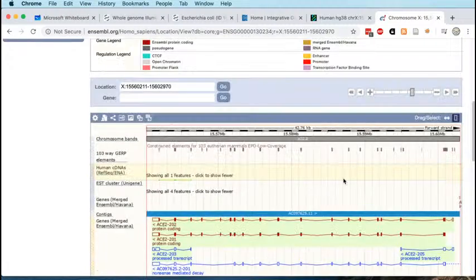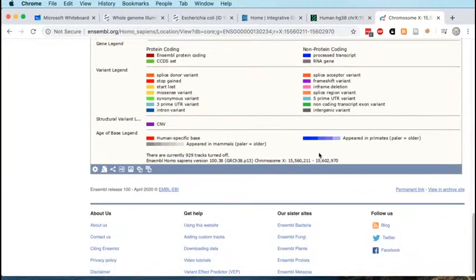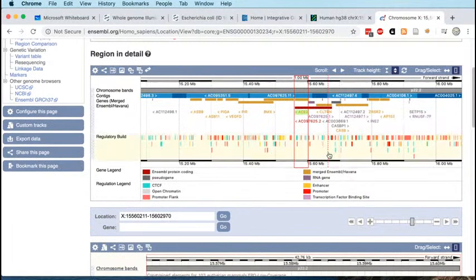So these are two web apps, websites which provide this kind of interface to reference genome data, and they're very good at that and very useful because of that, particularly if you're working with human genomes, but also other organisms which have a well-established reference genome. These tools can be hugely useful.